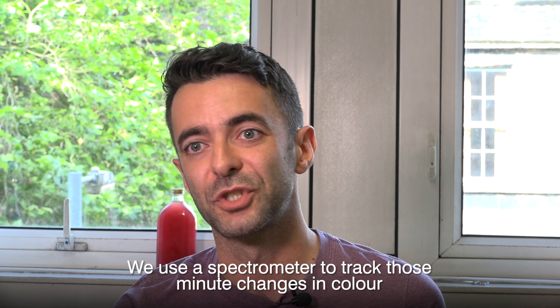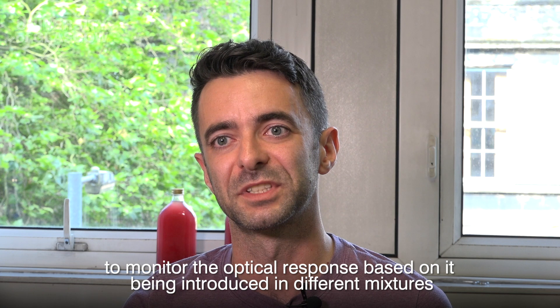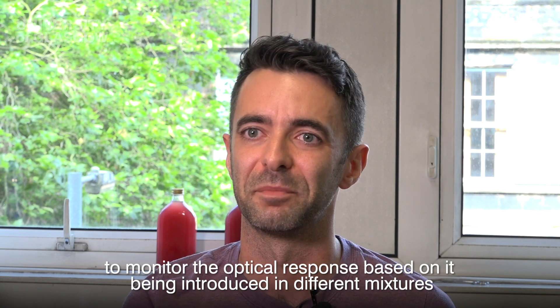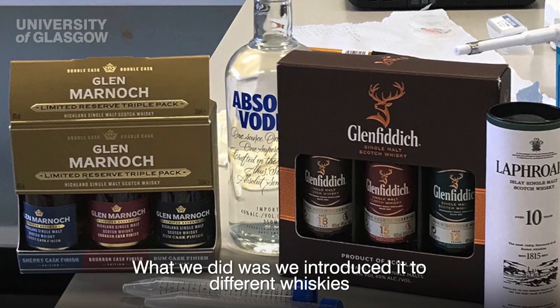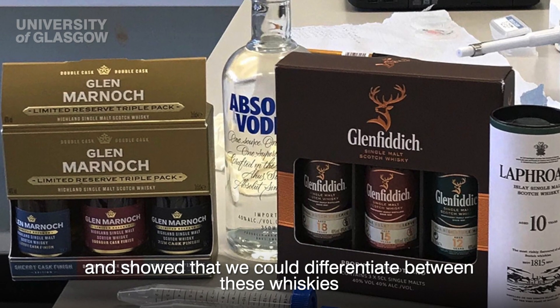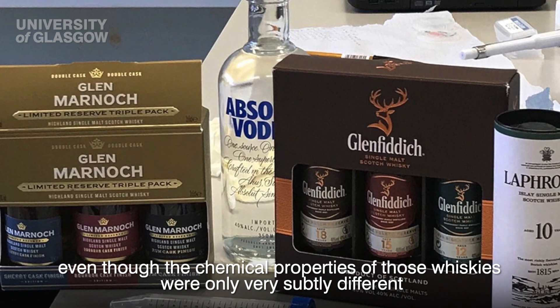We use a spectrometer to track those minute changes in colour to monitor the optical response based on it being introduced to different mixtures. So what we did is we introduced it to different whiskies and showed that we could differentiate between these whiskies, even though the chemical properties of those whiskies were only very subtly different.